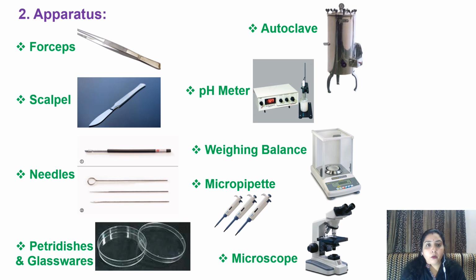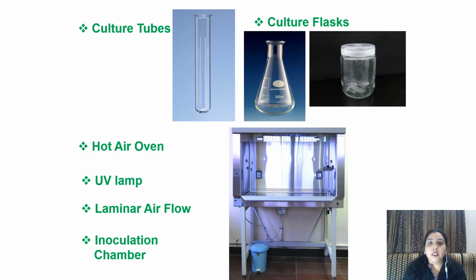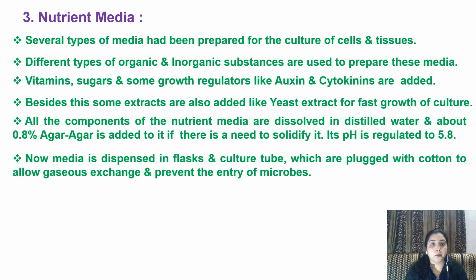The apparatus we required are forceps, scalpel, autoclave for sterilization, pH meter to maintain the pH of media, weighing balance we required during preparation of media, micropipette, different needles, petri dish, and microscope, along with culture tubes, culture flask, hot air oven, UV lamp, laminar airflow, and inoculation chamber.